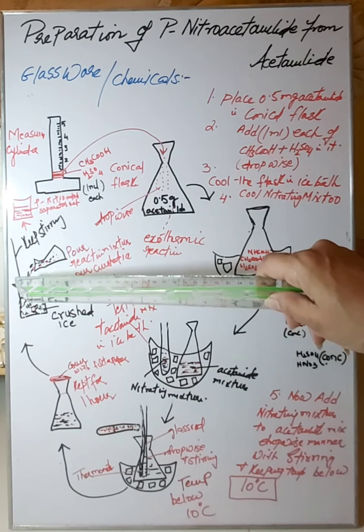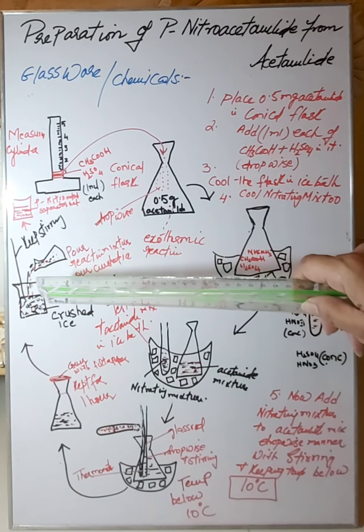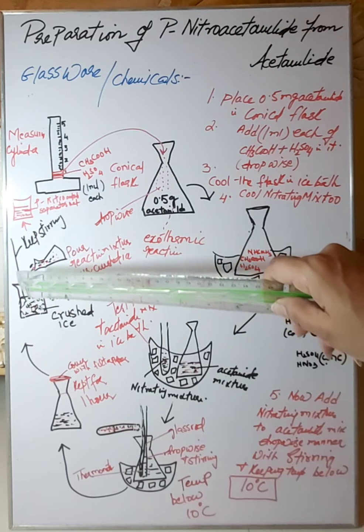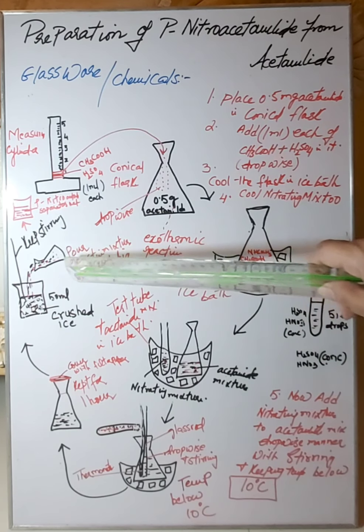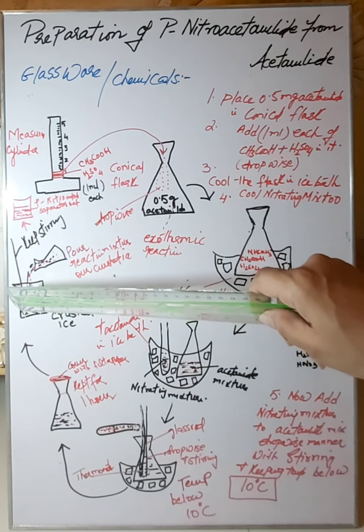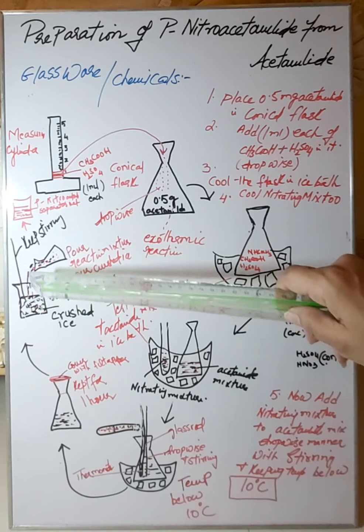You will find beautiful yellow precipitates, and when you have filtered out all the compound, you will wash it with distilled water, right? How you're going to wash it: you hold the filtration flask and the funnel that contains your compound, that is your nitroacetanilide, and you pour that distilled water over the sides of the funnel. It is preferable to take cool distilled water. Then you will see that it is all washed, and you are left with the product.